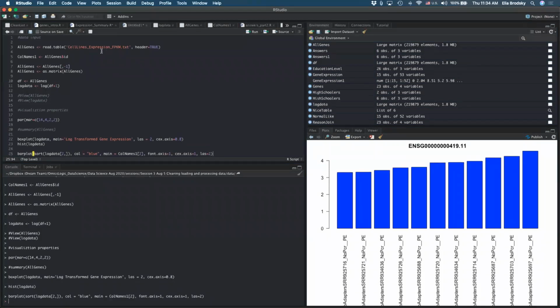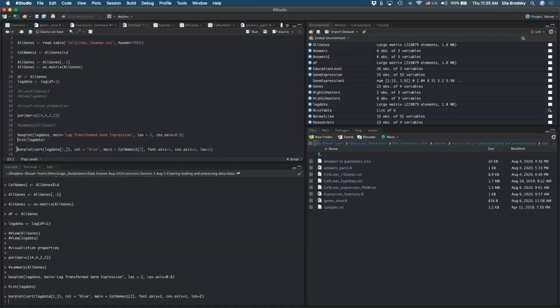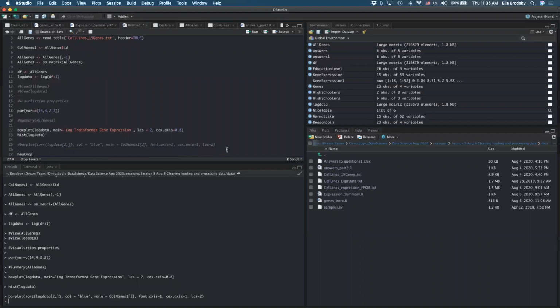So an easy way to do that is, instead of looking at each individual gene, we can just take cell lines, cell lines 15 genes. And let's take a look at what that actually does. Cell lines 15 genes. Okay, and so here, obviously, we don't want to do all of this. Well, we can do a box plot, we can do a histogram, we can do this. Well, we don't need this. Let's do a heat map. So just heat map.